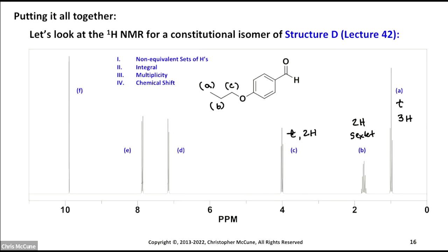This is C here. And then I'm going to draw on the hydrogens here, and I'll put one there, recognizing the other side, it's symmetrical. And so you're going to double up on those. So D is going to be the one that's further away from the aromatic carbonyl. So this will be D, and it's next to right here. So that should be a doublet, and you can see the doublet. So this is a doublet. And that's 2 hydrogens. So I'll write doublet so you don't get confused.